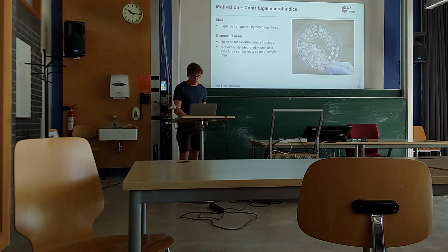And here you have a chip, you manufacture it like it is here, based on a PDMS mold, and then can seal it with a simple foil, adhesive foil for example. And that's the reason why you can simply throw away the chips when you don't really need them anymore.